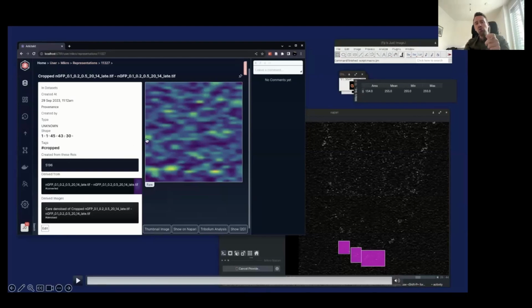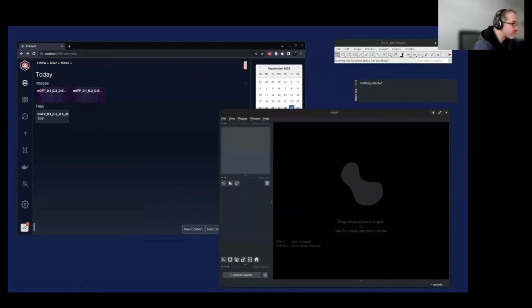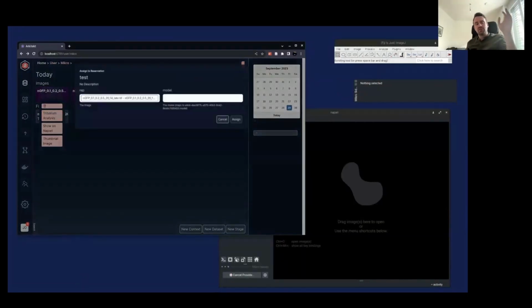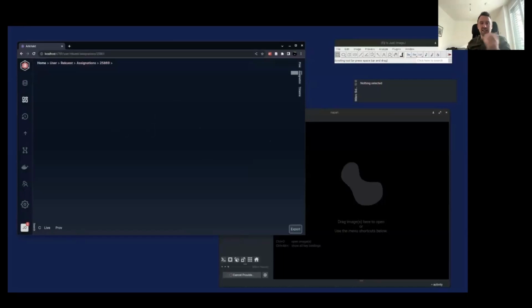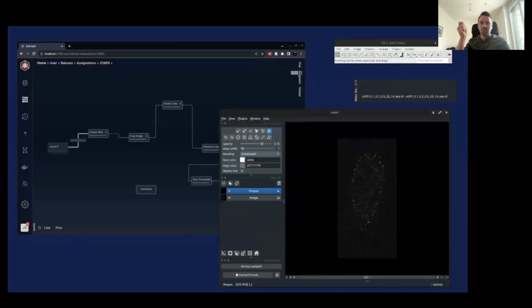I know what tasks have been done. So if you do a catch-all task and you adjust anything, I don't know what operations you did on your data. That goes into the data provenance aspect that is integrated in the platform. But it is definitely possible, and I use it exactly like this for the most part, because a lot of times you need to fine-tune.